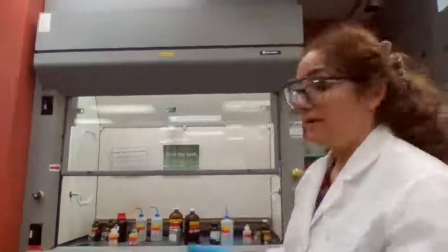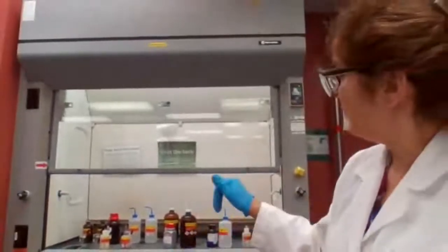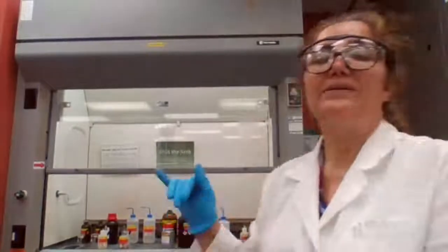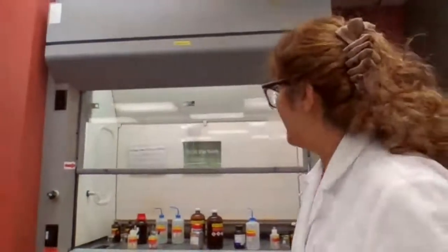So another amine, a secondary amine. This was the primary amine, but the reason it dissolved is not because it's primary, it's because it has less than 5 carbons. Okay. Next one.